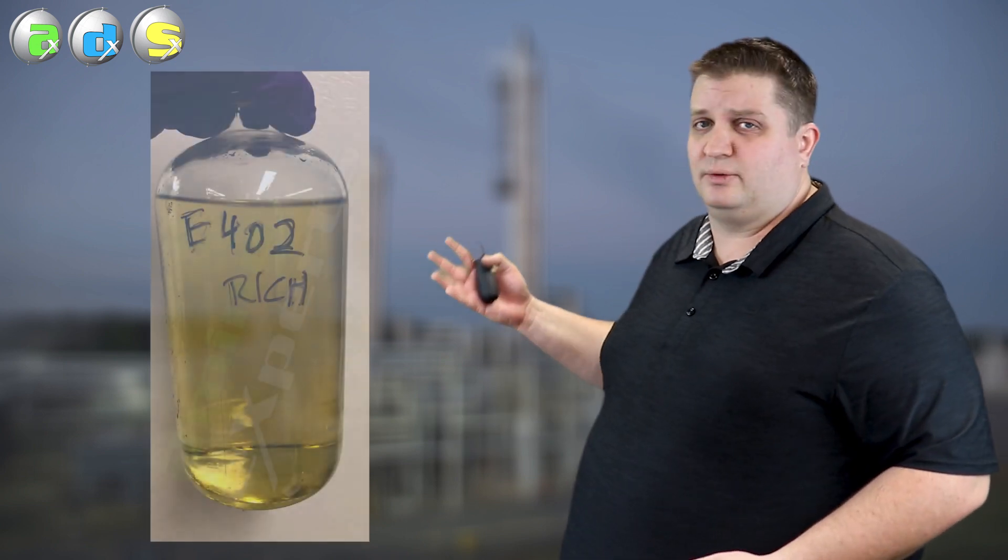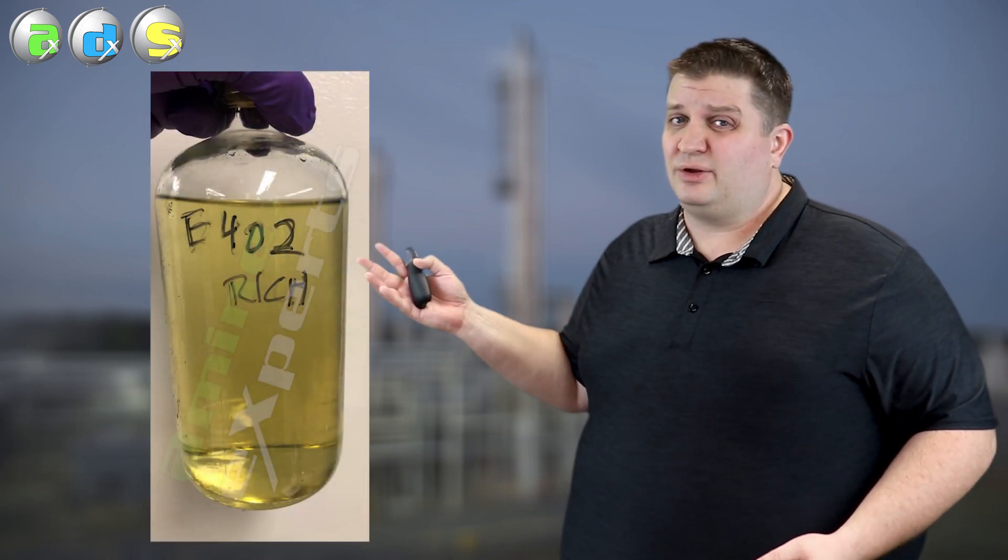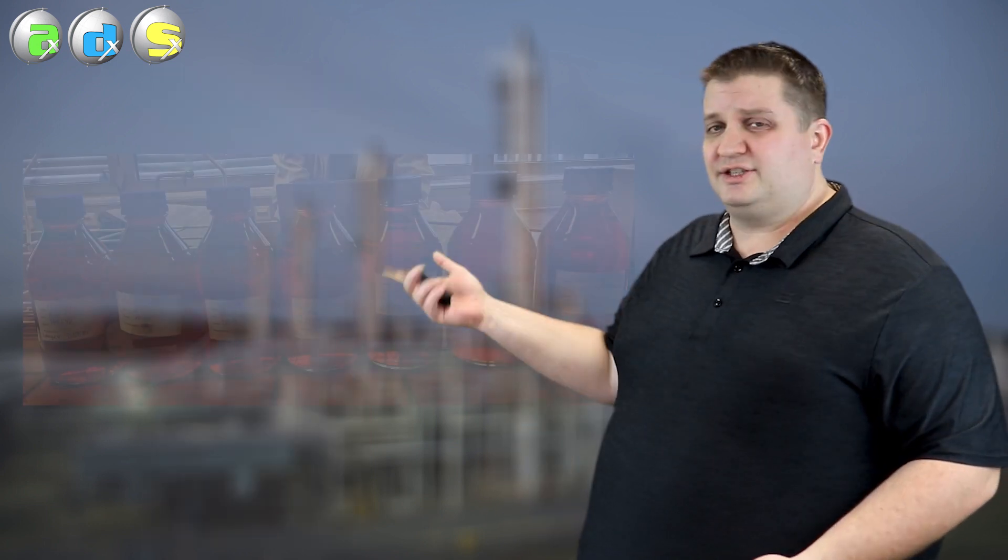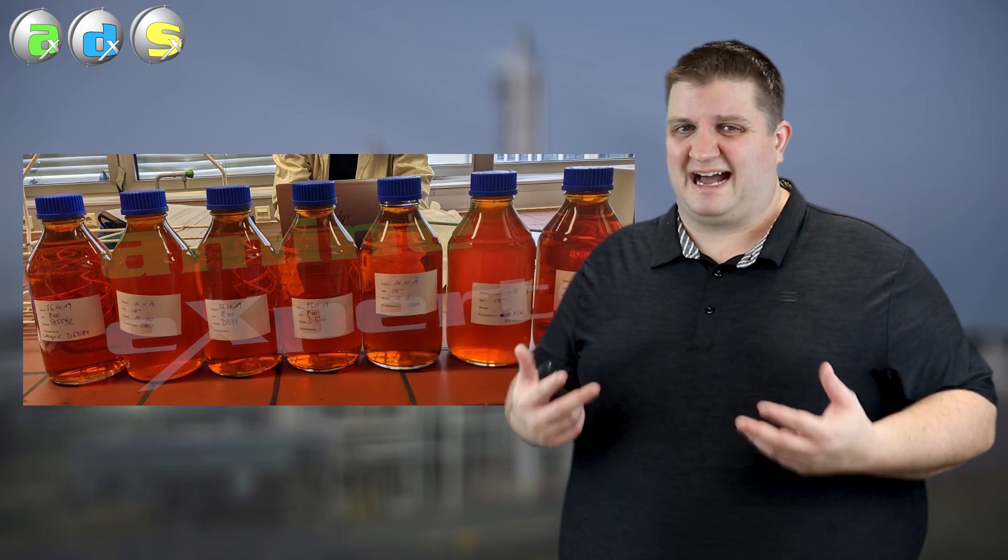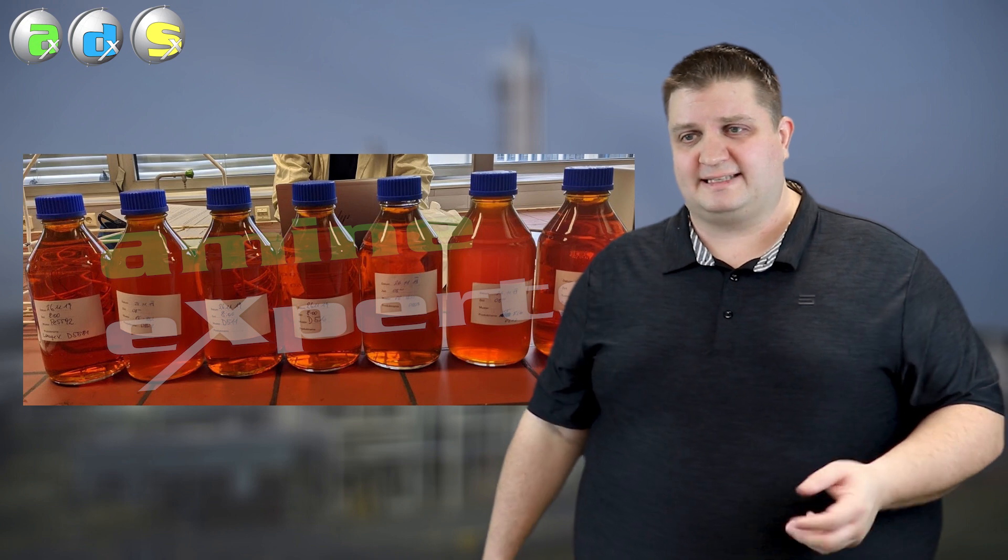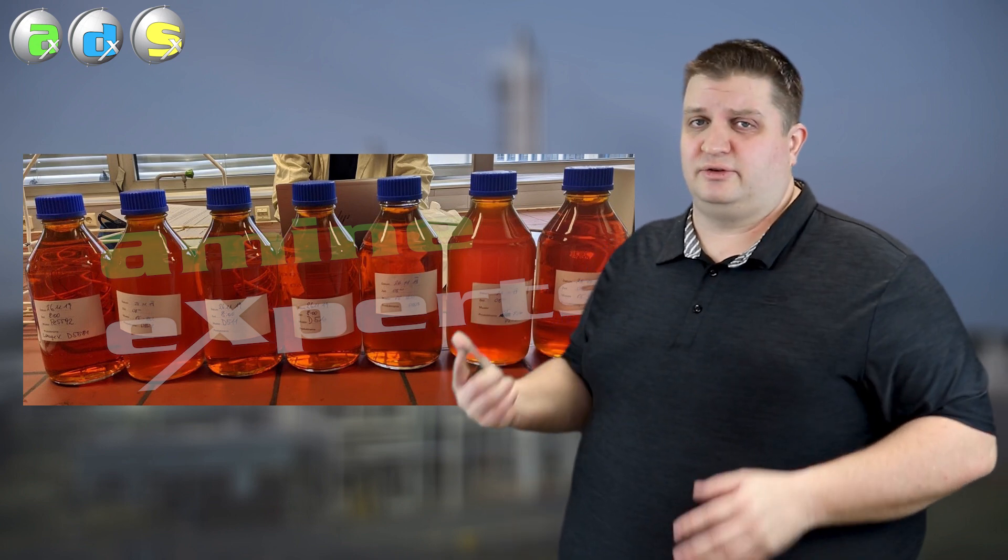Where we start to get issues is when you start to get colorations. The very first thing here we're going to look at is a yellow amine. The yellow amine typically means you've got elemental sulfur going on or you're starting to see low levels of degradation. Eventually it could turn into this which is an orange amine which means you're getting high levels of degradation whether it's oxygen based or thermal based. Either way this is now an issue you need to look at.